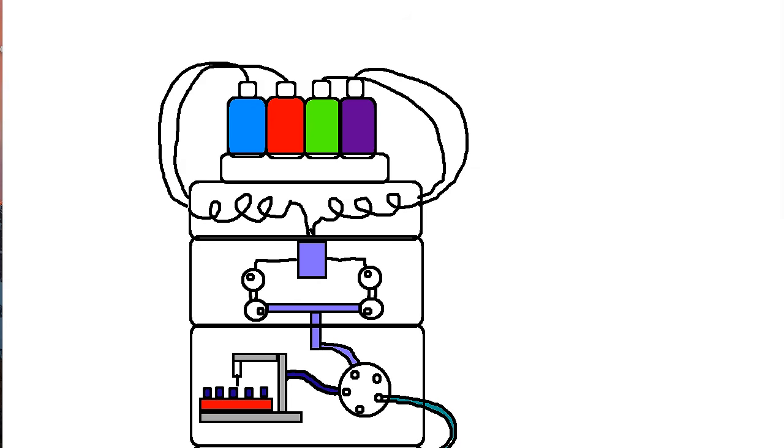Okay, so here we are. We have the setup for what the HPLC would ideally look like if we had the system, and we could briefly look at the insides. Again, this is still a simplified drawing, but it's more detailed than what I showed a few minutes ago.